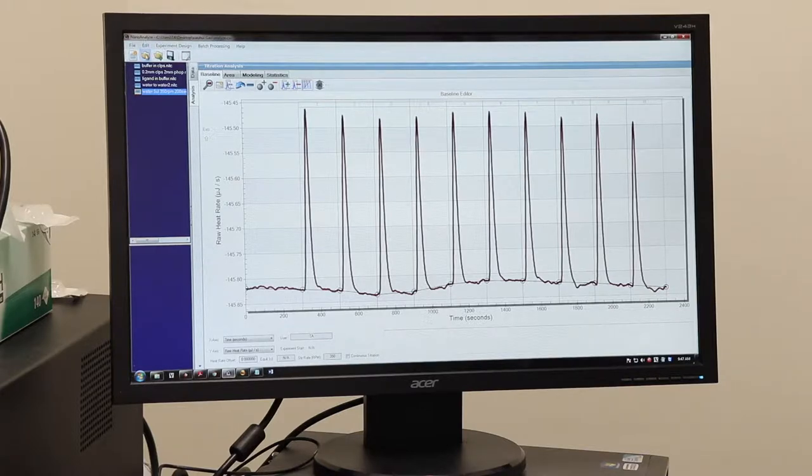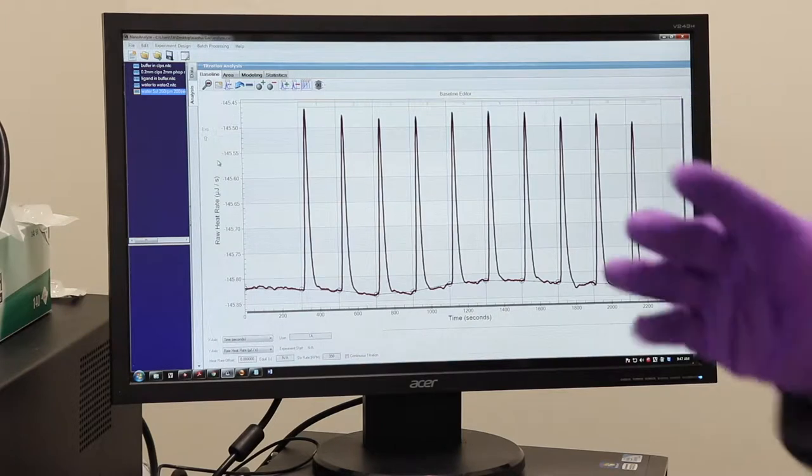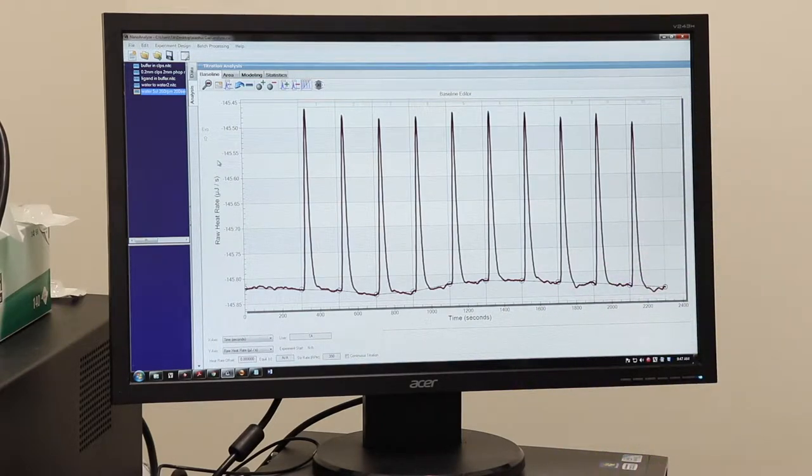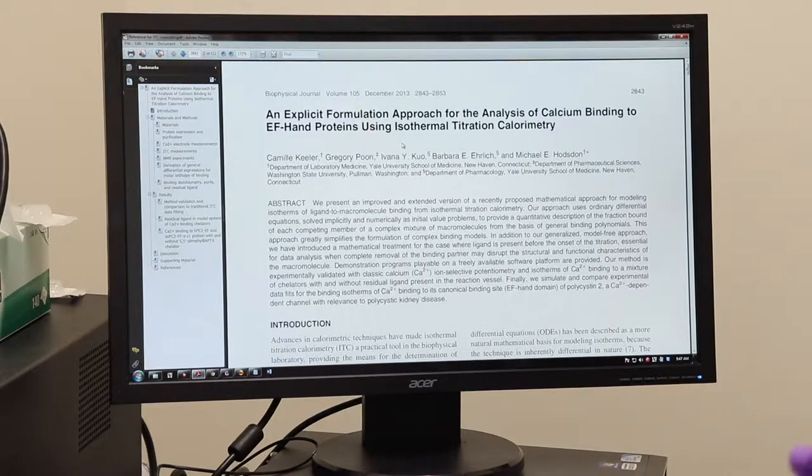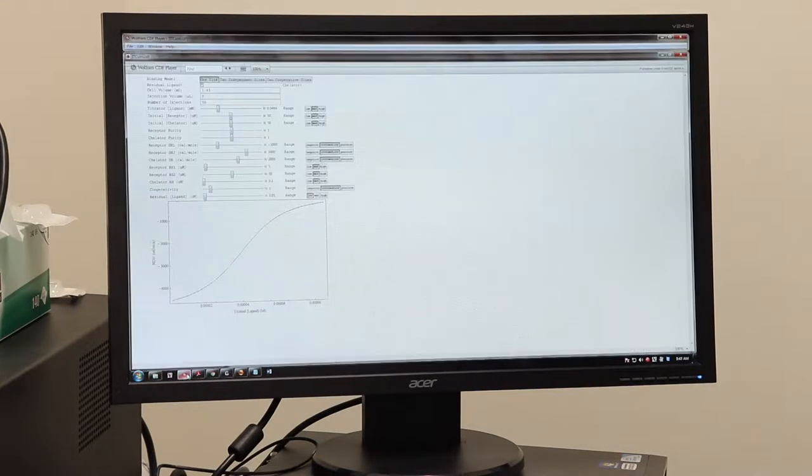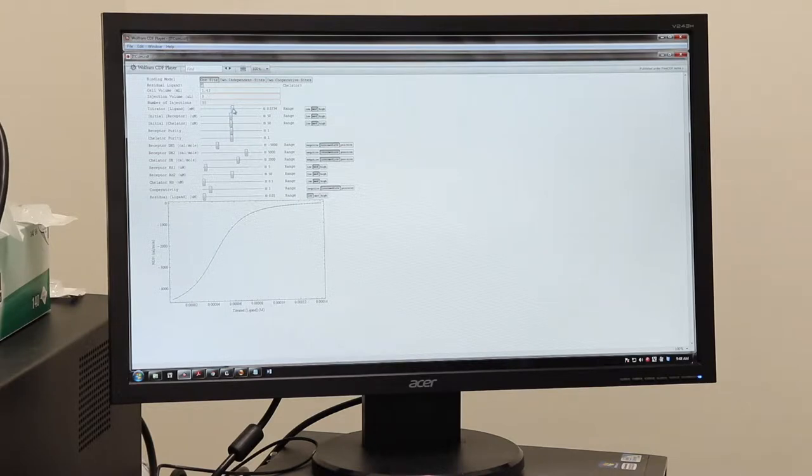Other software is nanoanalyze. You can load one or multiple data sets and this is where you'll do all your analyzation. You can export your data and analyze it in your own program if you want to. The analyze software has a simulator in it that you're welcome to use. Also, loaded on this computer is another simulator which is quite advanced. My friend Camille and Mike Hodston published his paper a few years ago, which included developing the software package which runs in Wolfram. And basically it's an interactive ITC simulator. So you can put in all your values here. And a lot of the values are more advanced than the common experiments. And it's real time. So you can just move these tile switches and you'll see what your titration should look like after you analyze the data.